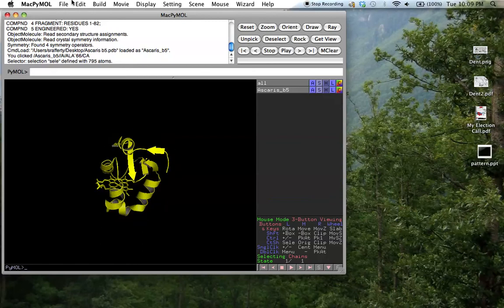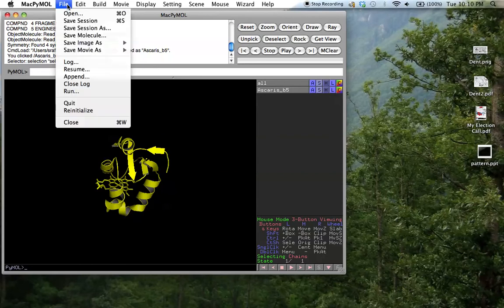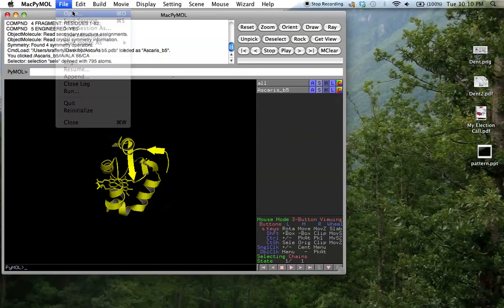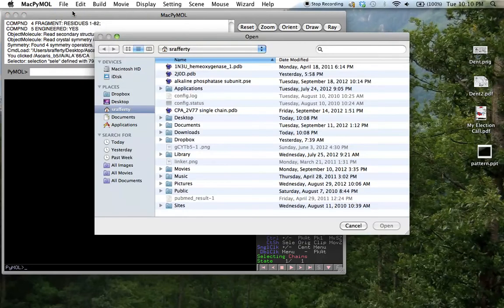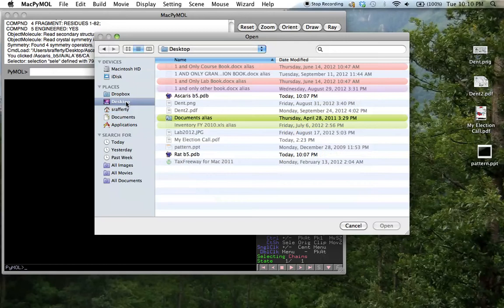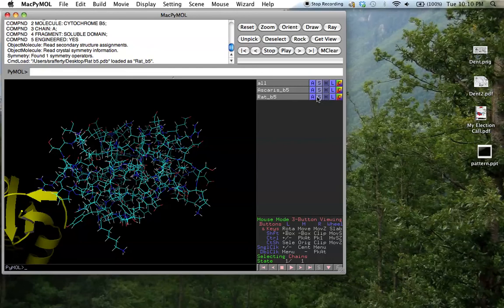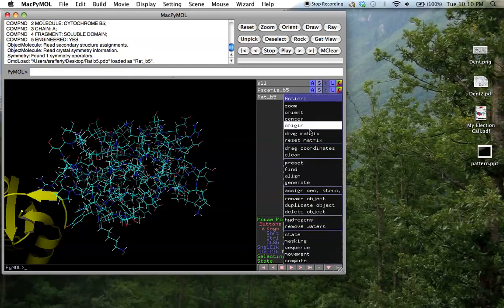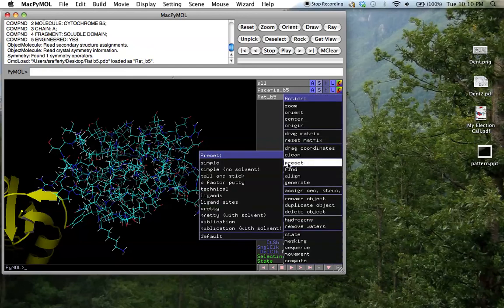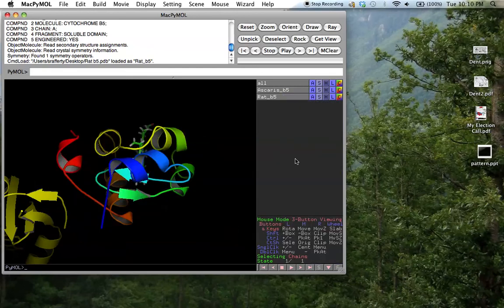Now from within the PyMOL program, we open up the rat structure, change its view, and change its color to something else.